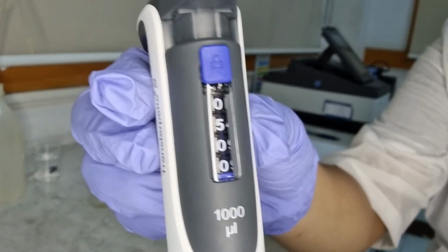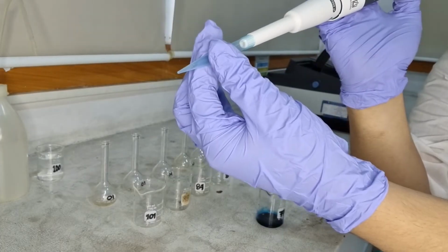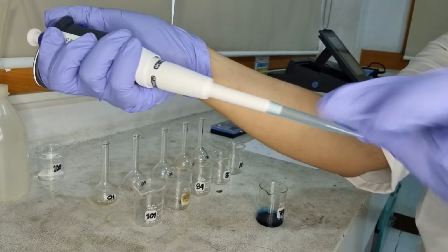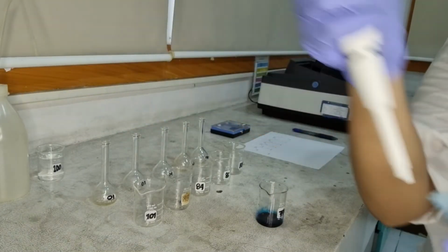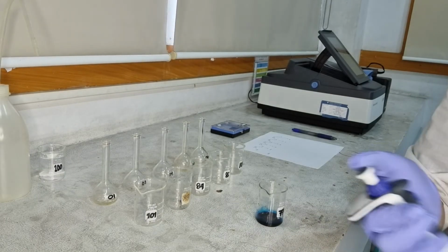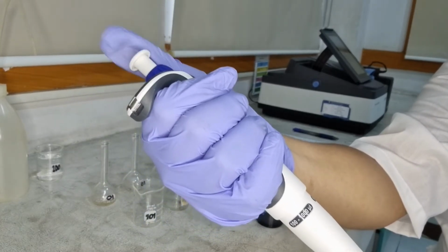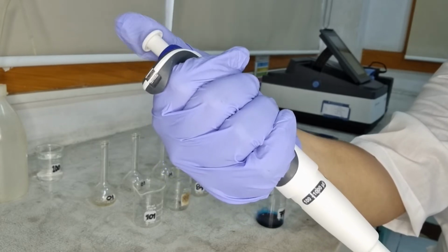To transfer the dye, I'm using a micropipette. These micropipettes have disposable tips and are calibrated to be useful if you're dealing with volumes less than 1 milliliter. To pipette out your desired volume, adjust the dial and press to the first stop before submerging the tip. When releasing the contents, press to the second stop to ensure that everything is released.